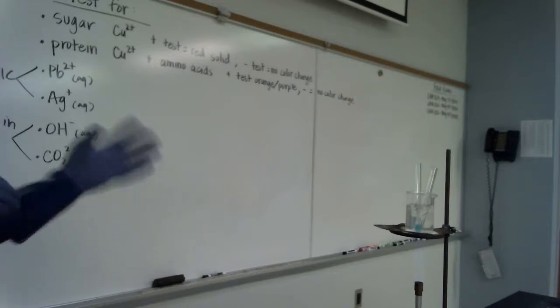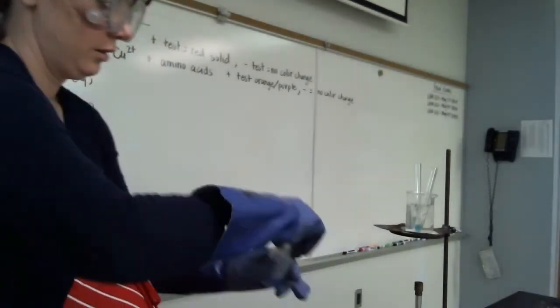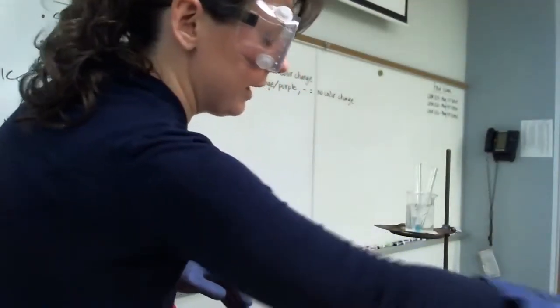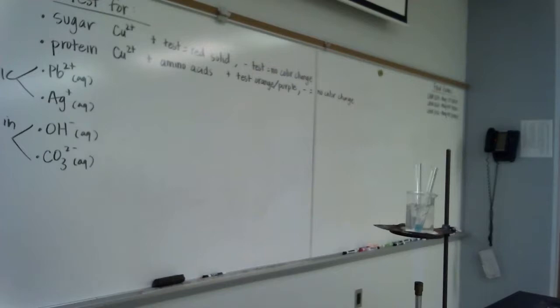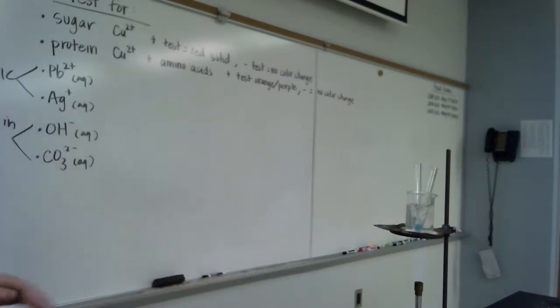So again, I'm doing those two first so that they can react while we do our other ones. Our other ones are going to be immediate results. We'll know right away. All right, let's talk about how we're going to test for lead.